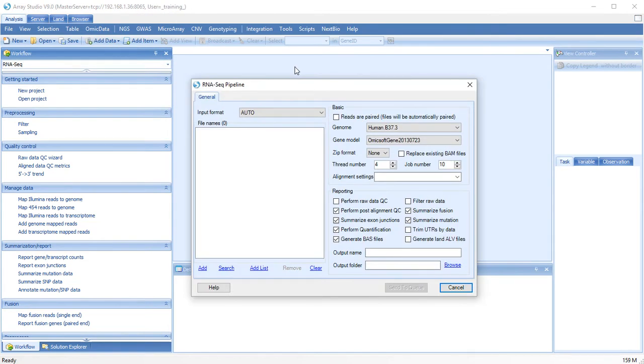To start the RNA-Seq pipeline, we need to first add our raw FASTQ files. The pipeline assumes that these reads have already been filtered and stripped. This can be performed with the ArrayStudio NGS filtering module.